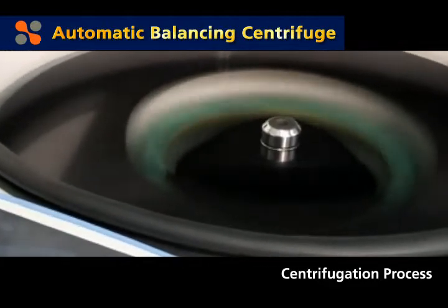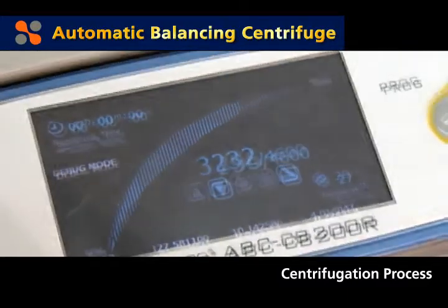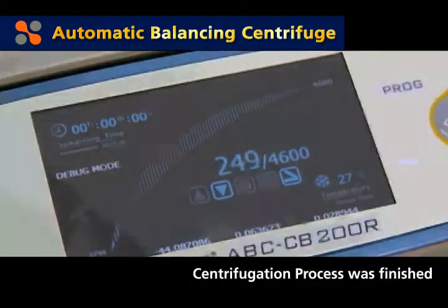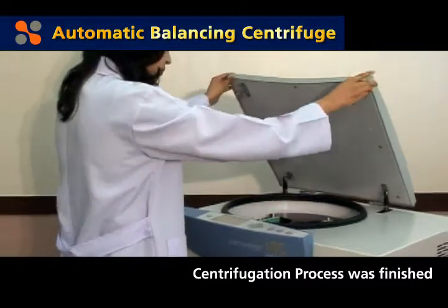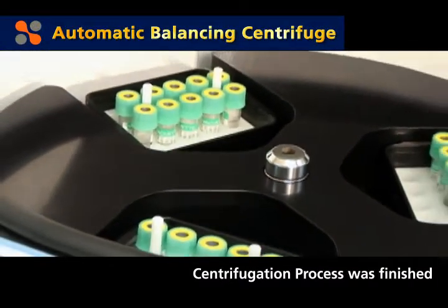The LabMaster ABC-CV accelerates and reaches a constant speed based on the user's setting values. After centrifugation, the rotor starts to slow down at a set level of deceleration and then finishes the process.